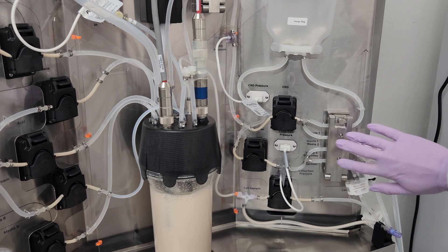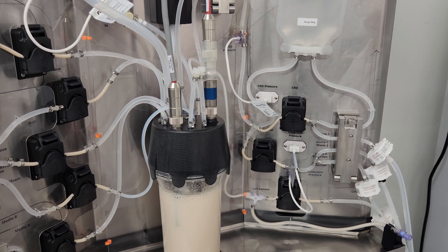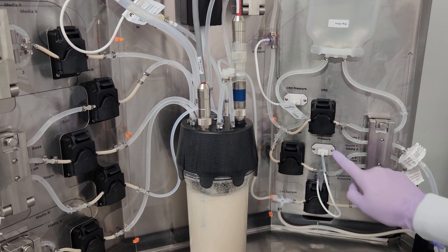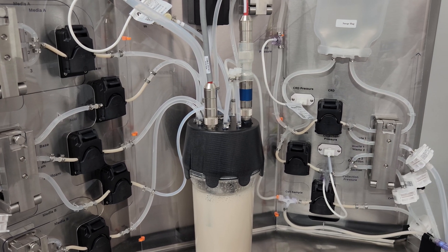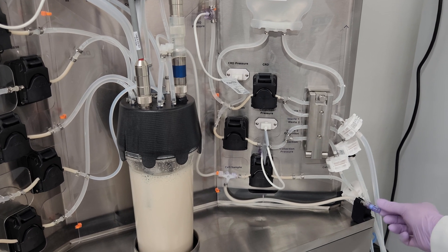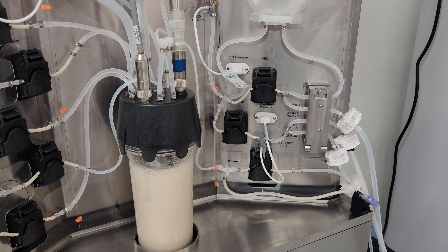The automated valves here control the flow of fluids to either waste or collection. There are two pressure sensor ports: one for monitoring the pressure inside the cell retention device, and another for the pressure of the perfusion collection line. Lastly, we have a sample port mount at the front right corner of the Daisy Petal, which supports the valve to enable quick and easy bioreactor sampling.